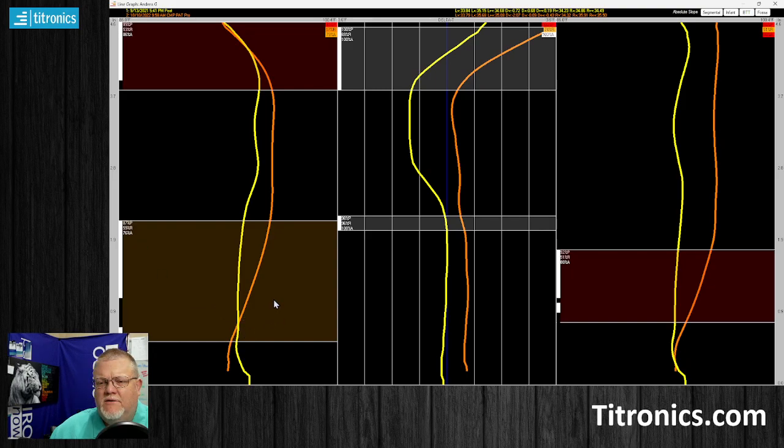So with this crossover, we can see something is changing here between pattern and this scan. And over here we had an 80, a 51, and a 92. Again, with those being different slopes, we're going to have a lot lower congruency between the 3.